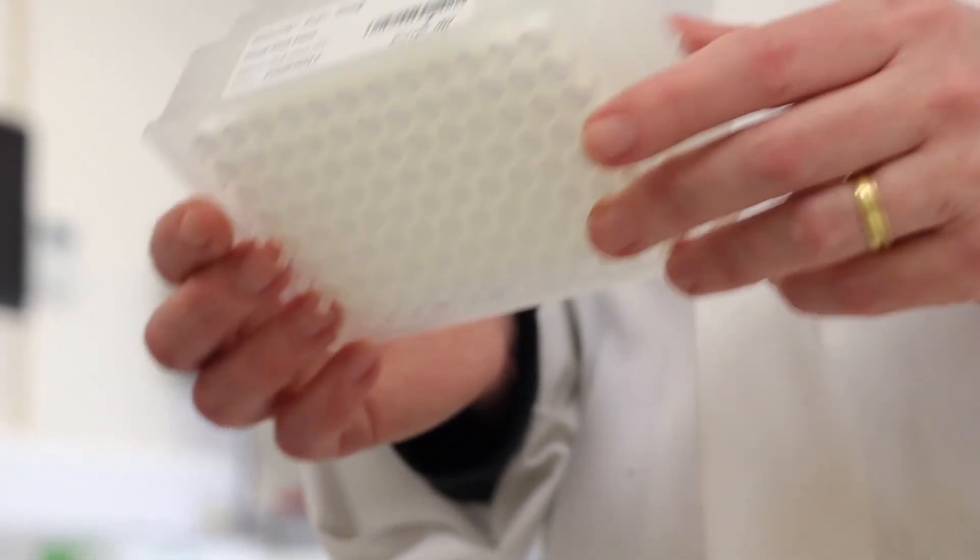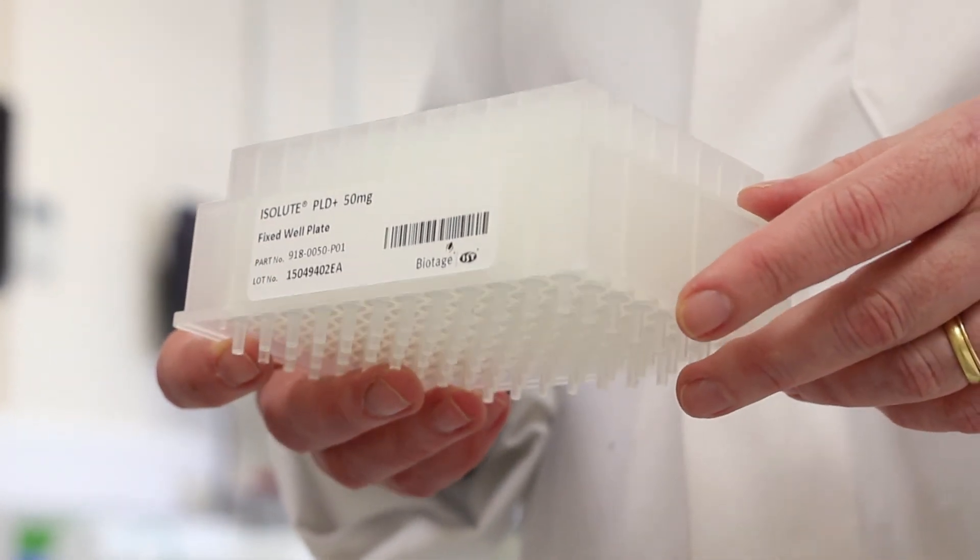Isolute PLD Plus plates clean up your samples simply but very effectively. They improve your LC-MS analysis and are very simple and easy to use.